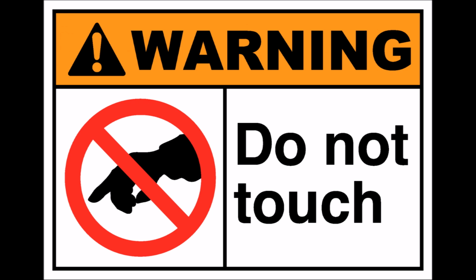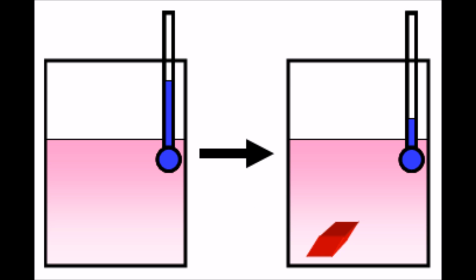Another method is called slow cooling. In this method, the solution is heated to its boiling point and a solute is added to the point of saturation. In the end, it is transferred to a heat bath or allowed to reach room temperature slowly. As this happens, the crystals begin to form as the temperature drops. This is what would happen if we were to make salt crystals using NaCl.